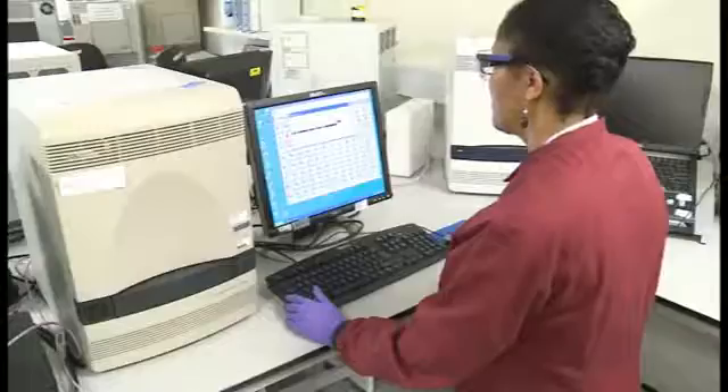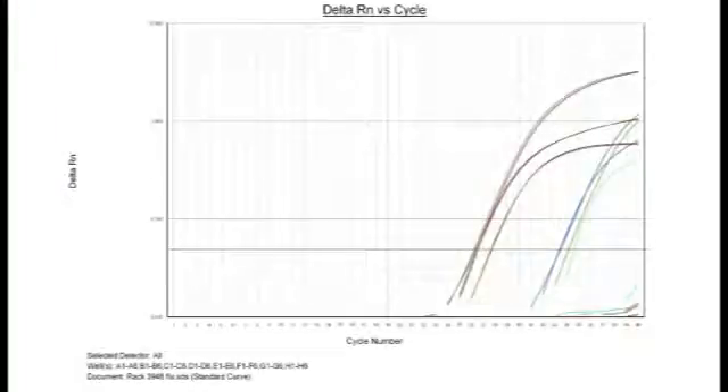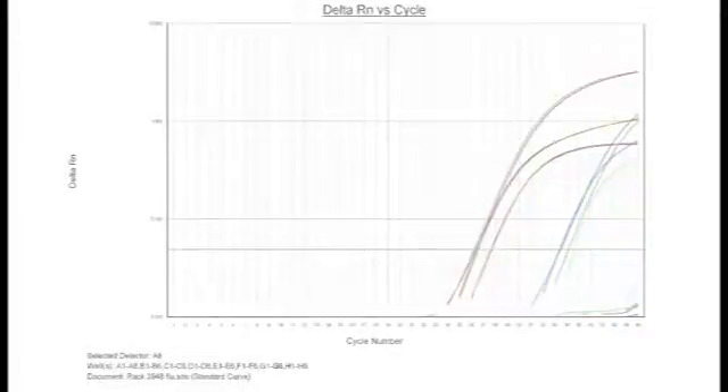Here I am setting up the PCR machine that will actually do the reaction for us. The PCR machine is very important. It's called a real time PCR machine because as the results are coming off we can see those results as a graph. Very strongly positive samples will be seen as a graph sooner, and weaker samples will be seen coming off as a graph later. The real time PCR is really quick — from sample receipt to exported results we can do this in five hours.